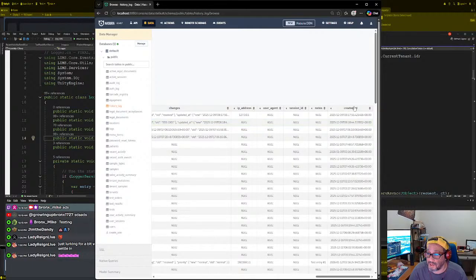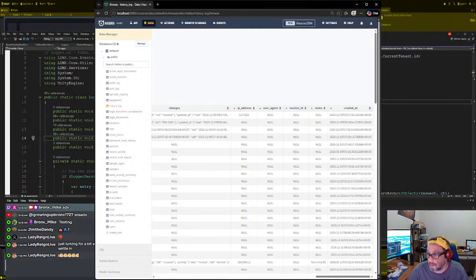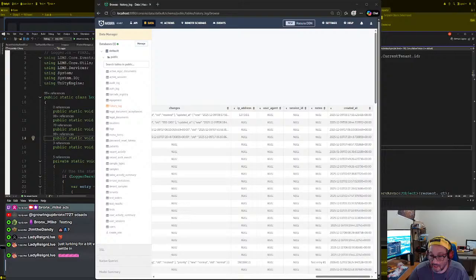Instead of timestamp, we're gonna do created at, which is here. Make sure we spelled that right. Yeah, created at. Yep. Timestamp, created at. Now it should work.